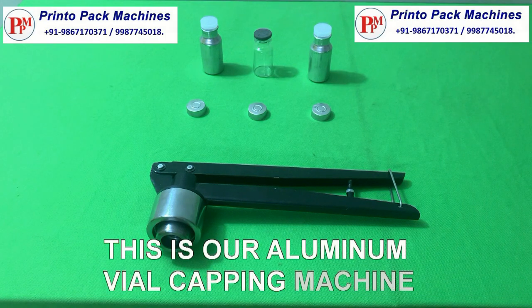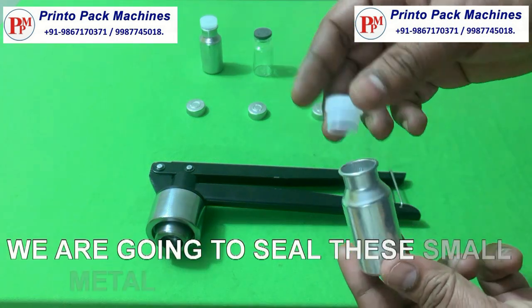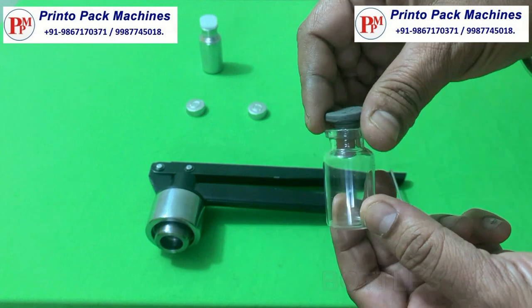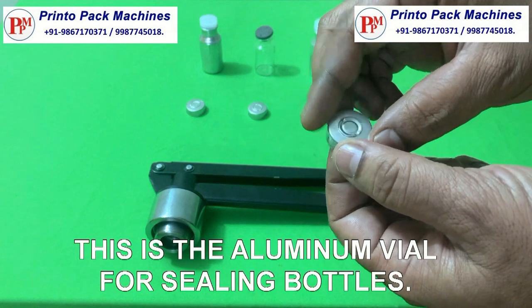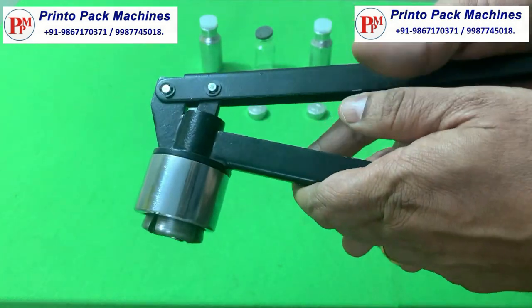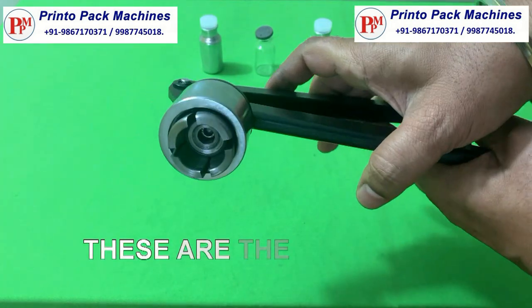This is our aluminum vial capping machine. We are going to seal these small metal and glass bottles. This is the aluminum vial seal for sealing bottles. These are the crimping jaws of the sealer.